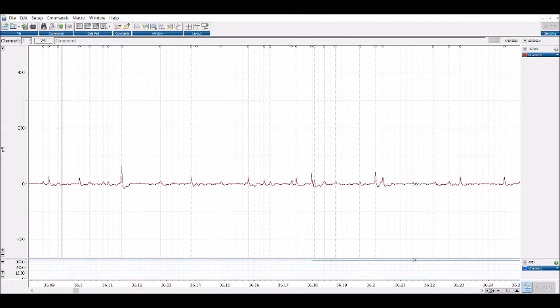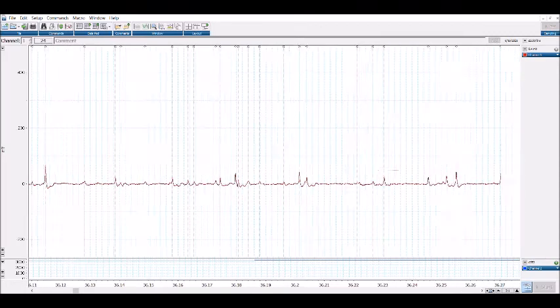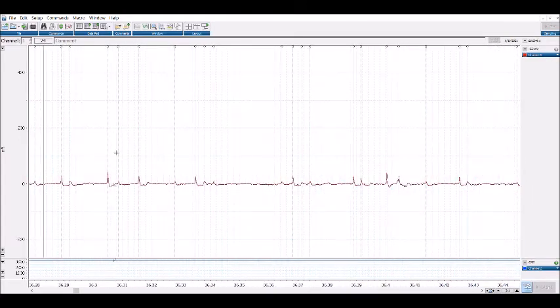And some of them you can see that like maybe it is, maybe it isn't, and it's kind of subjective, which is why we need this reproducibility scoring, to see how subjective this is, if we get the general trends the same, or if the person counting it can be way off in what they are or not counting. So here's another 2. Keep scrolling through this. See this one, either or, maybe a 2 there. 2.